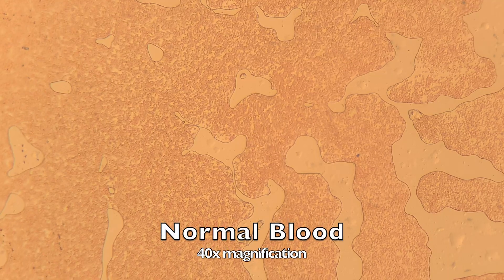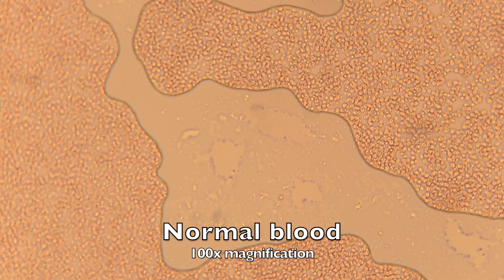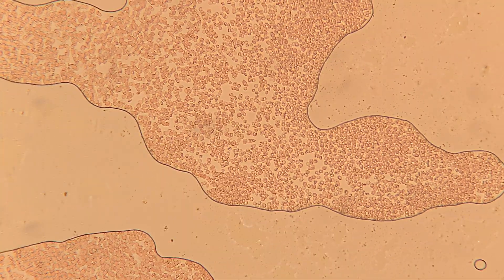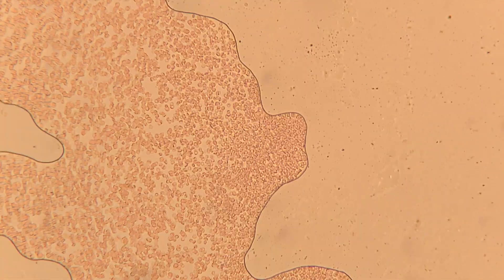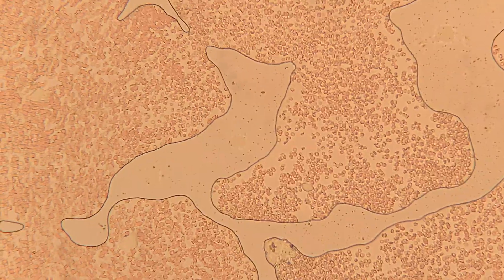This is our first slide here and as you can see there are a lot of red blood cells moving around, and they aren't swimming on their own. You might have seen in my other videos there are lots of bacteria and ciliates and things that do have the ability to swim, but these guys don't have any tails or anything — they're just floating throughout the liquid, which is plasma.